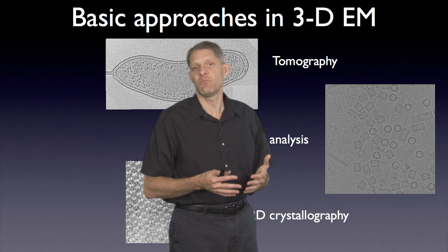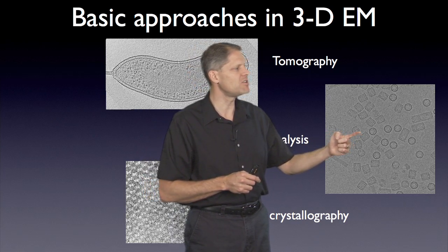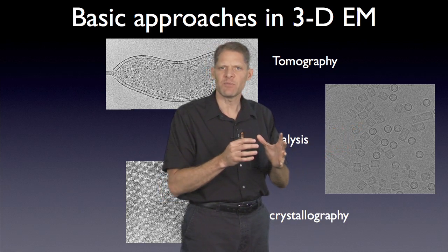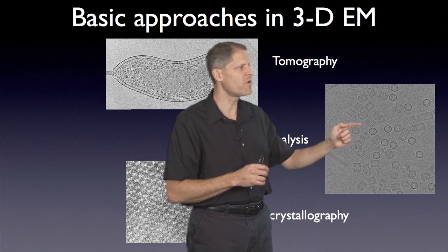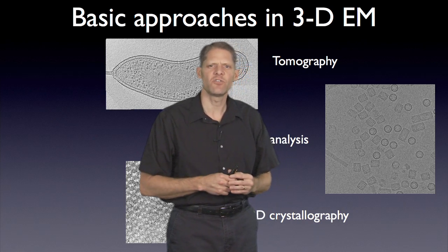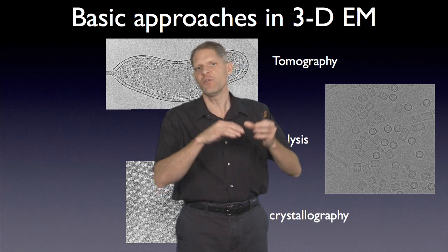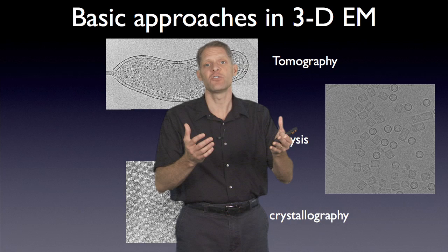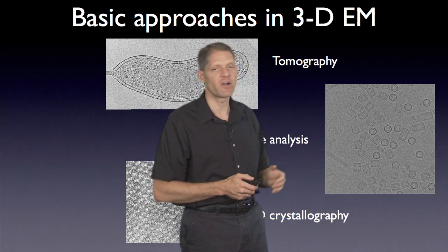Then the challenge of single particle analysis is to take each of these individual images and find the orientation and the alignment parameters that are required to align each of these particle images with all of the rest, and then you average them together to produce a much higher signal-to-noise ratio reconstruction. The averaging both gives you all the views put together in 3D, and it allows you to boost the signal-to-noise ratio and try to interpret high-resolution details. And so this is single particle analysis.